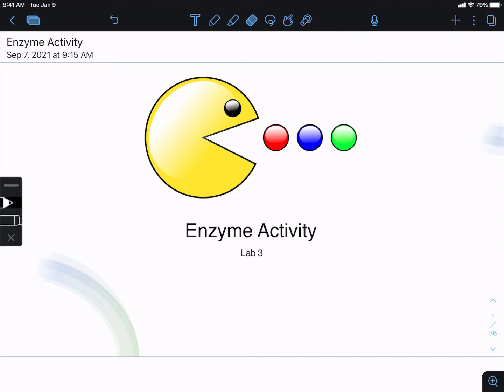The purpose of this lab is actually not to study the digestive system so much as it is to study the effects of concentration and pH and other factors, temperature, and so forth on enzyme activity. Nevertheless, digestive enzymes make a great tool for studying enzyme activity. They're very easily obtained and are fairly cheap, and so we can get them on the market without too much problem. We haven't had a chance to talk about the digestive system. We'll have a full lecture period devoted to the digestive system, but that's not until later in the semester, toward the end.